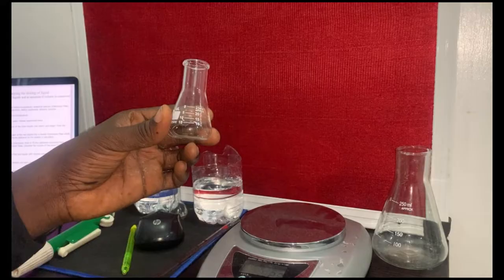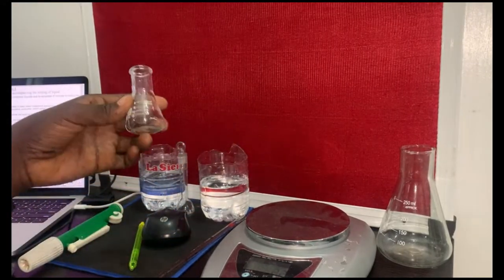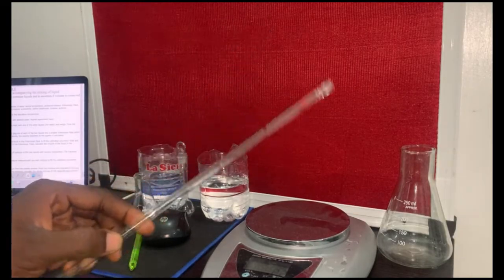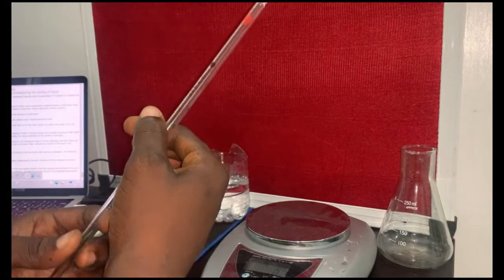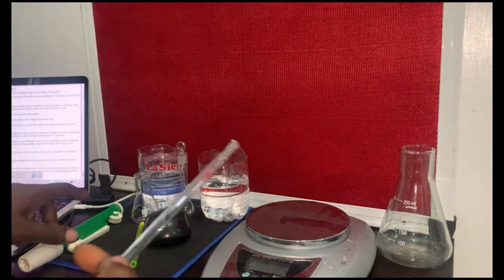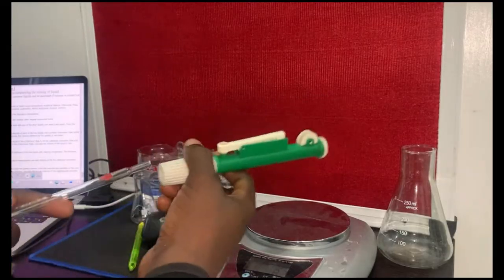So it's best you get to know or acquaint yourself with how these flasks are, in case you get to the lab. And we have pipettes. Every one of us here knows what a pipette is. In secondary school, we are very conversant with the 25 ml pipette that has a bulb at the center, right? Now in secondary school, you always use your mouth to suck the pipette, but in the university, in order to avoid liquid getting into your throat, there's what we call a pipette sucker.